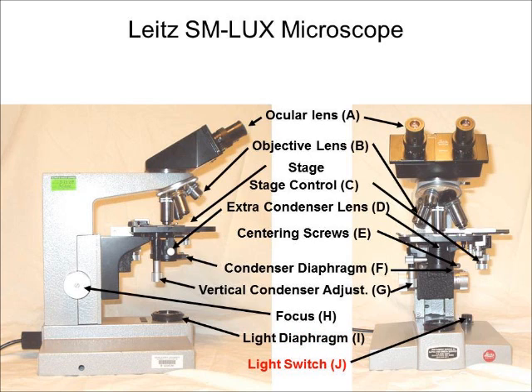And finally we have the light switch, which both turns on the light and regulates its intensity depending upon how far it's turned. I recommend that you turn the light on to its maximum intensity. The reason is that the spectrum obtained from the light bulb is a function of the temperature of the filament. If it is not turned up all the way, then you get more yellow in the spectrum and less blue. This is important for when you take photographs.